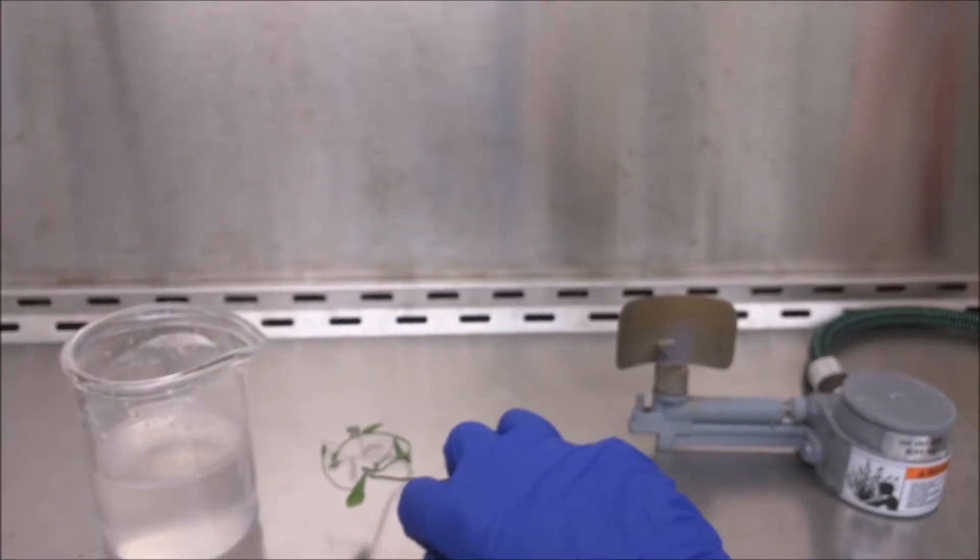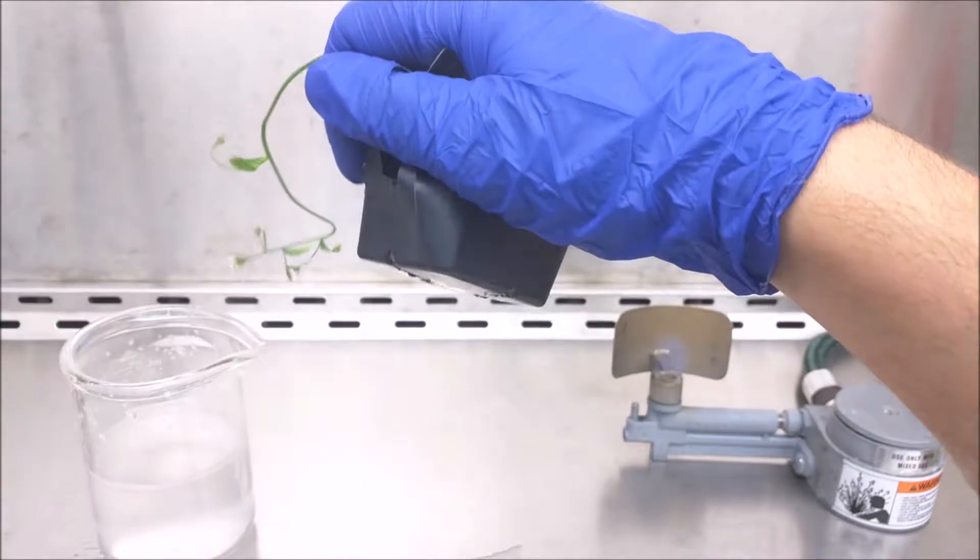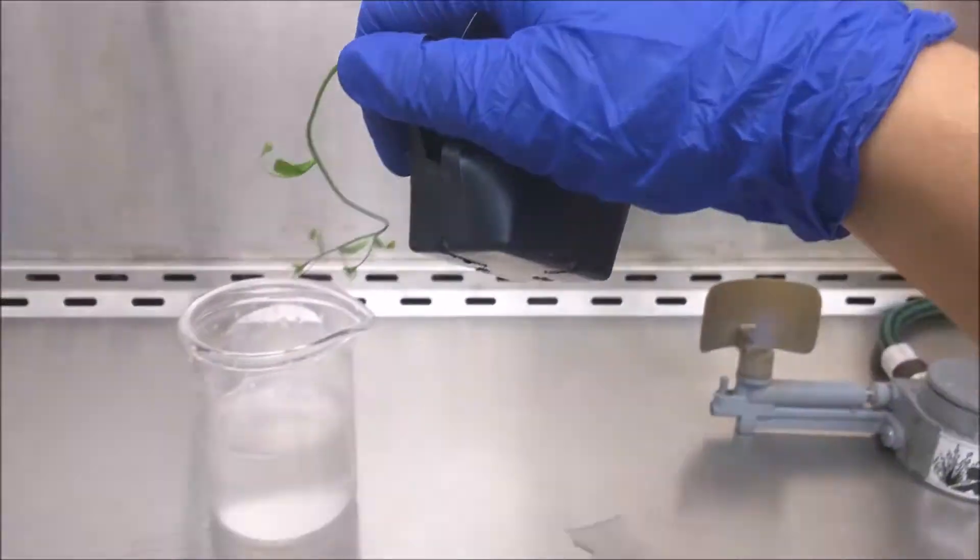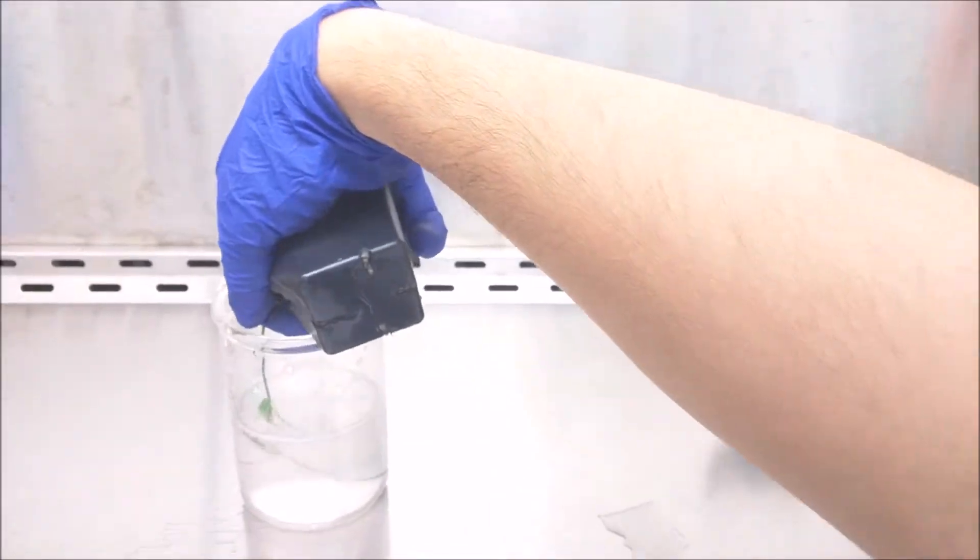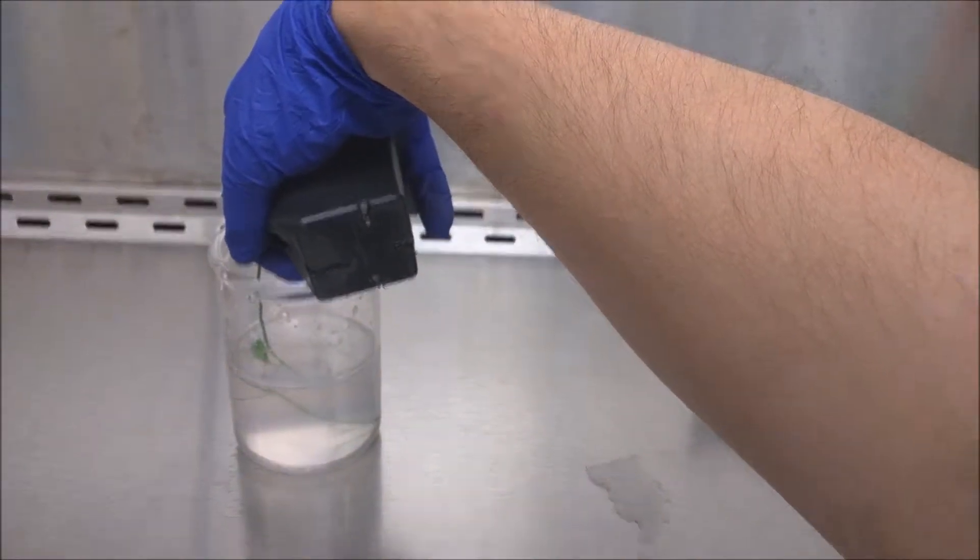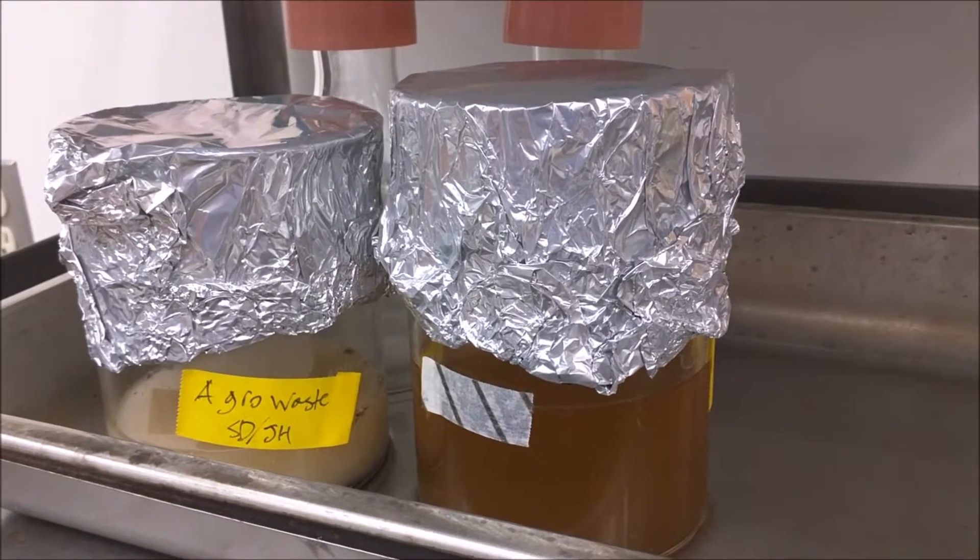Transformation is a simple dip in the solution. Always dispose of Agrobacterium correctly. These flasks have been autoclaved.